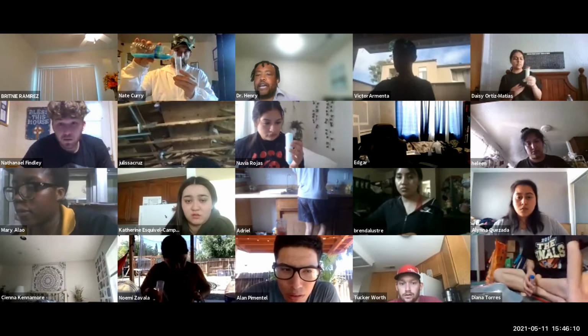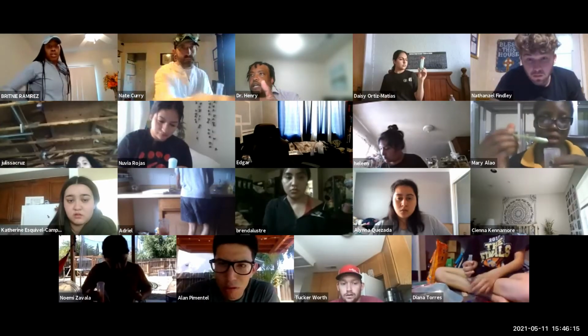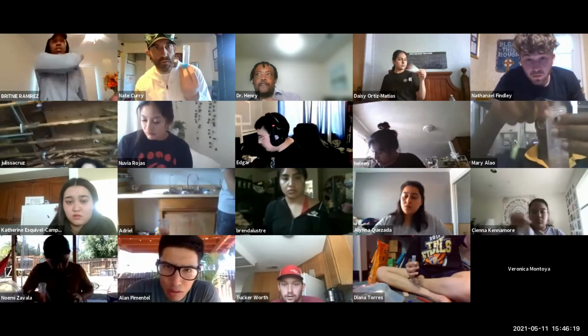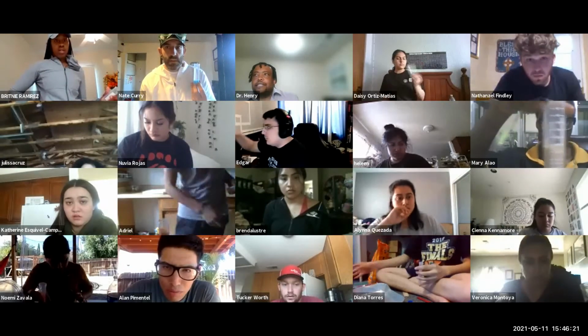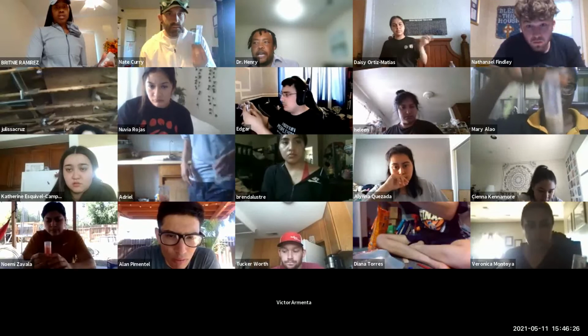It is 3 to 4 times with the, well, it depends on your condition. So for instance, Nate had one. If I were Nate, I'd hold up on doing it. Did you do the 5 or did you do the 10, Nate? 10. You did the 10. 3 times, 4 times now. Okay, so this is your 4th time with the 10.